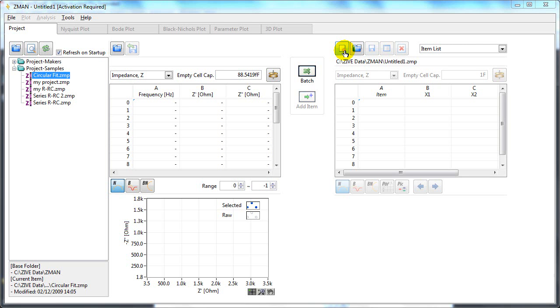If your EIS data has semicircles in the Nyquist plot, Zedman can do circular fitting.